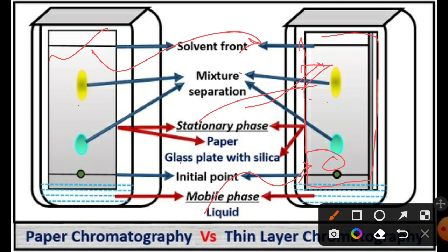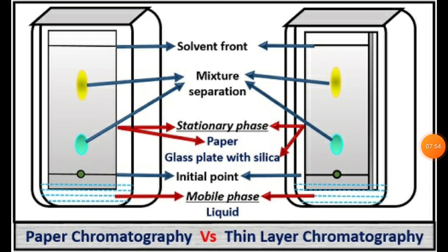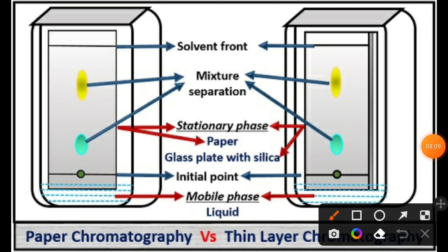So thin layer chromatography is especially used for amino acid separation, in a process called two-dimensional chromatography, along with separation of vitamins, okay. After separation we can visualize our protein sample by using a visualizing reagent, okay.